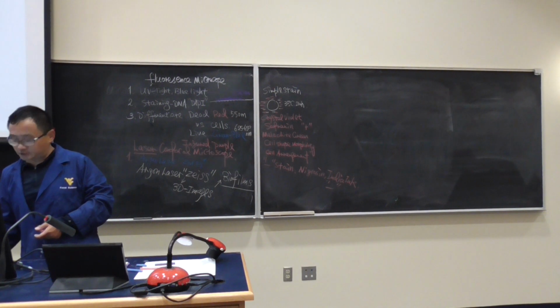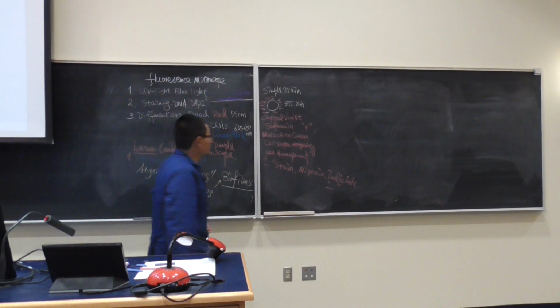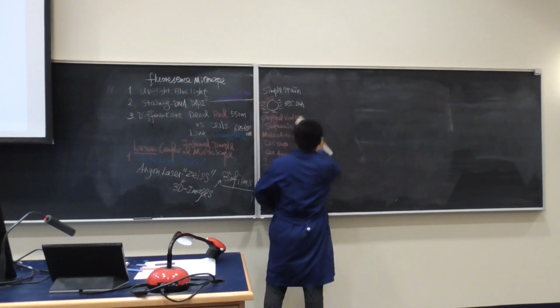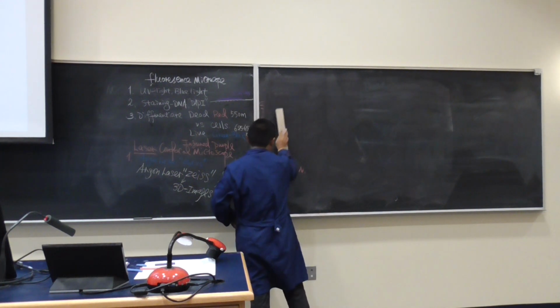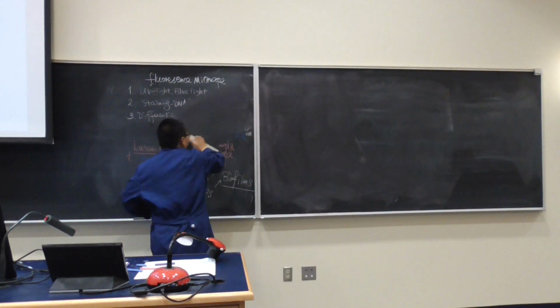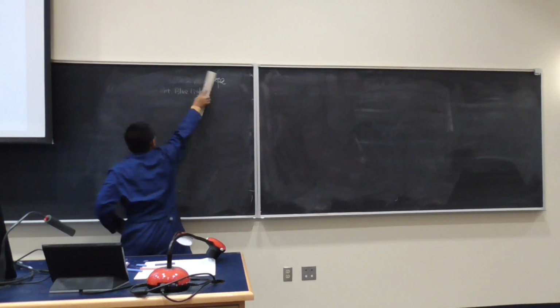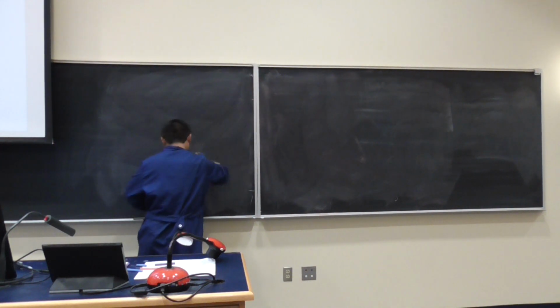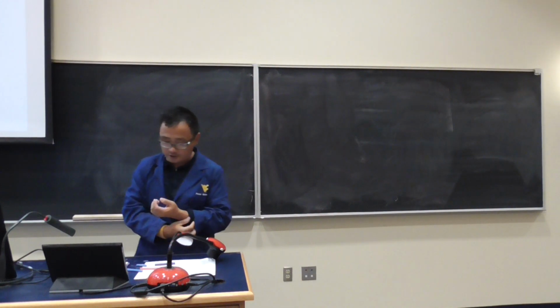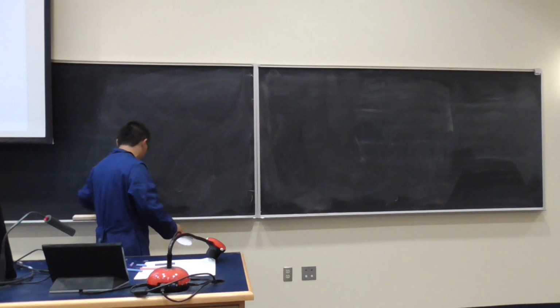Okay, so we want to spend a big chunk of time talking about the gram stain. This is a big deal in the classroom, and we want to explain it to you very well before you move to the lab. So I'm going to move these down and talk about it. You pretty much heard about that before, but here we want to explain it to you in much more detail.